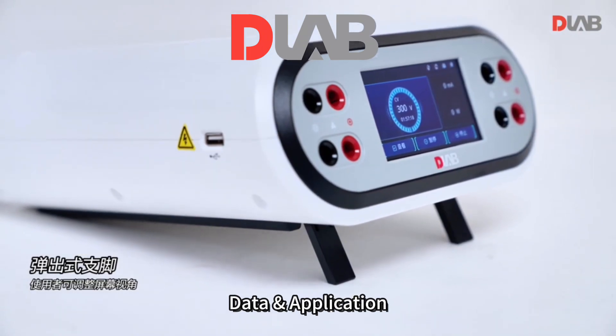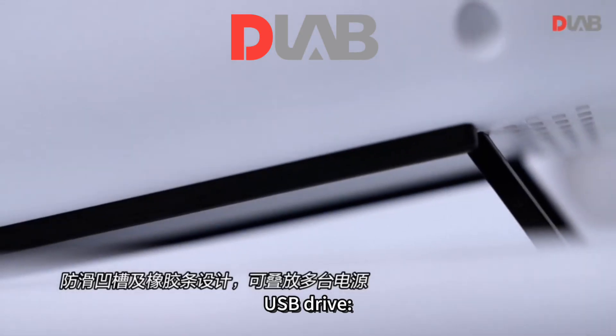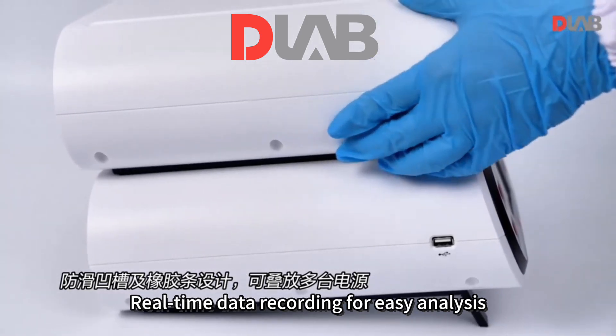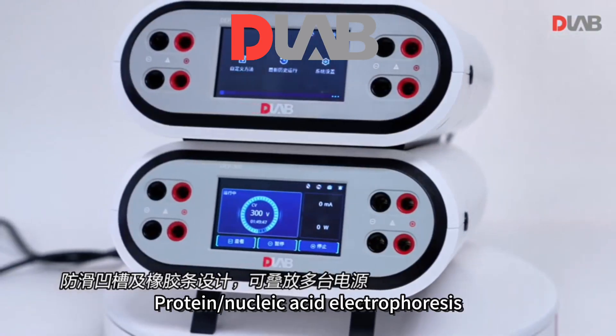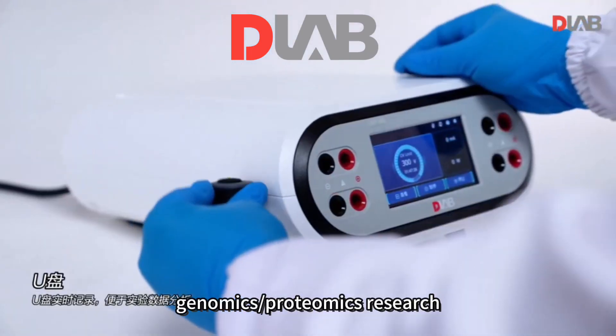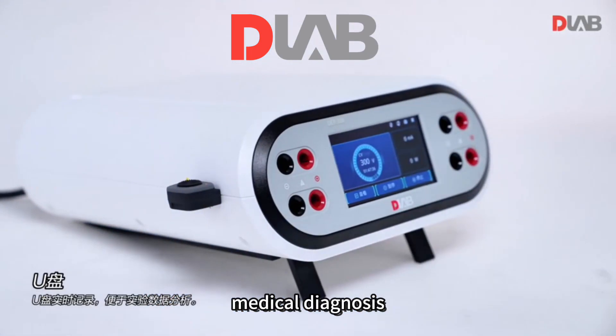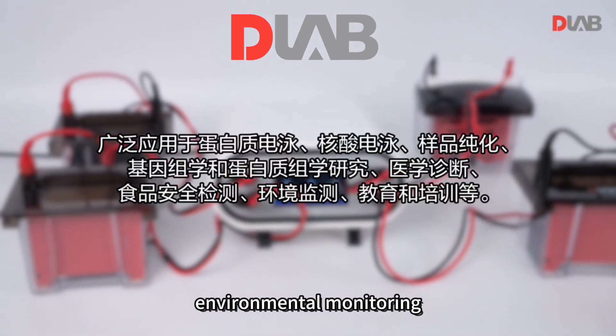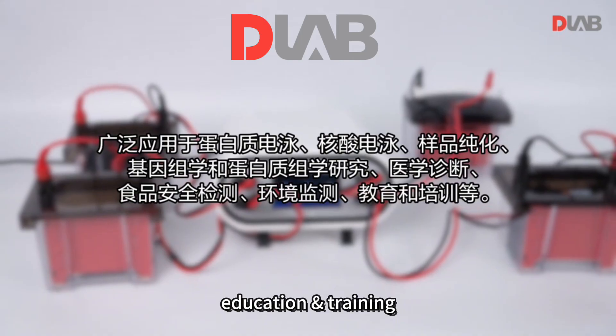Data and applications: USB drive with real-time data recording for easy analysis. Applications include protein and nucleic acid electrophoresis, sample purification, genomics, proteomics research, medical diagnosis, food safety testing, environmental monitoring, and education and training.